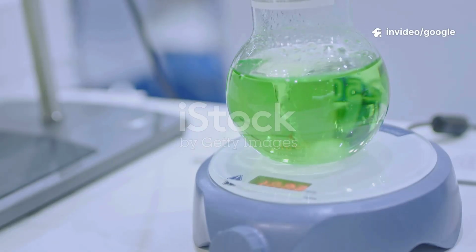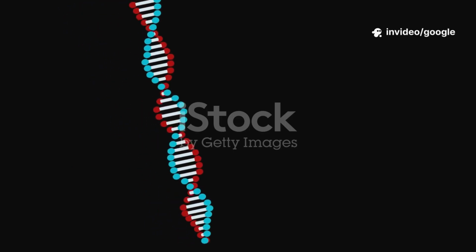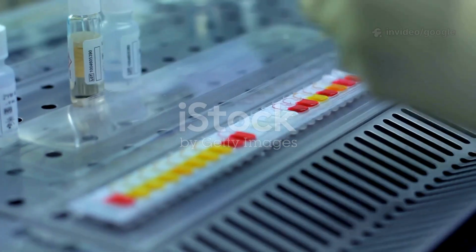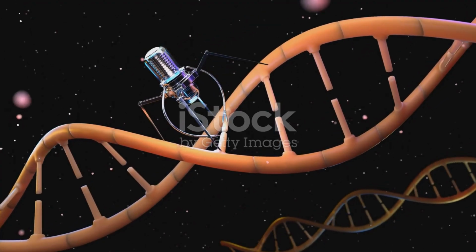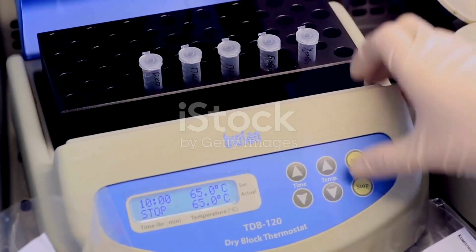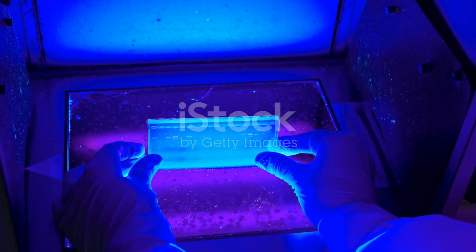Incubation. Gently mix the components and incubate at room temperature for a specified period, for example 5-20 minutes. This allows the Cas9 protein to bind to the gRNA, forming the stable RNP complex. Optional: in vitro cleavage assay, pre-validation. Before introducing the RNP into cells, you can perform an in vitro cleavage assay to confirm that your assembled complex is active and can cut the target DNA. This involves adding a DNA substrate containing your target sequence and PAM, incubating with the RNP, and then analyzing the DNA for cleavage, for example via gel electrophoresis.